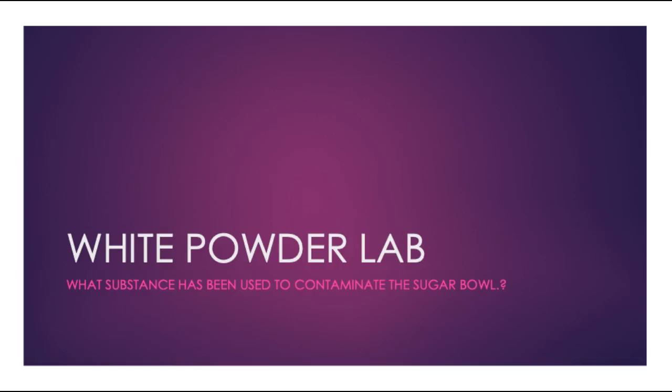This is the instructions for the white powder lab. What substance has been used to contaminate the sugar bowl? This draws on all of the stuff that we learned about chemical reactions and physical properties and chemical properties, and trying to identify and match up substances.